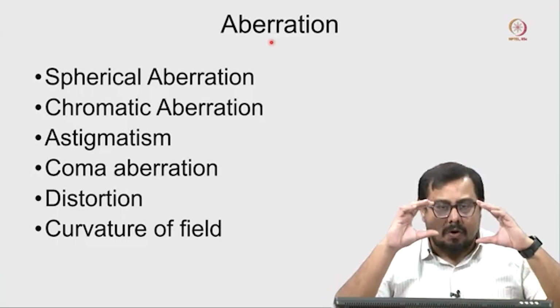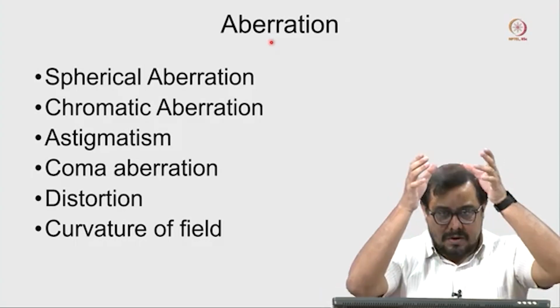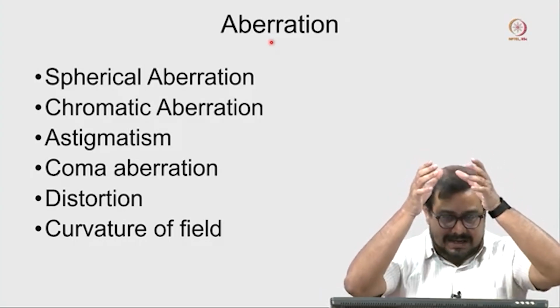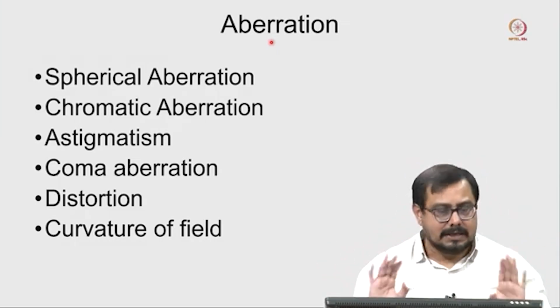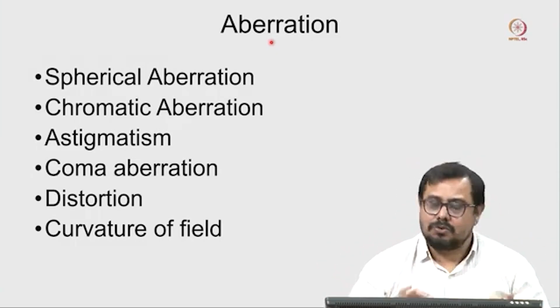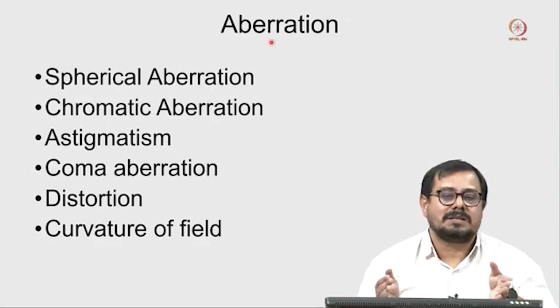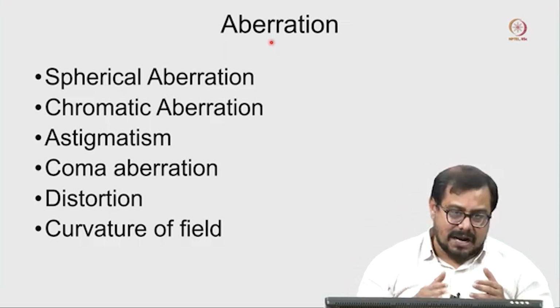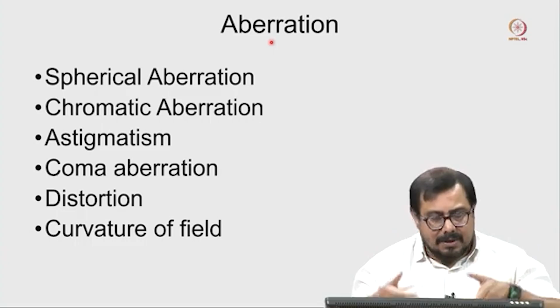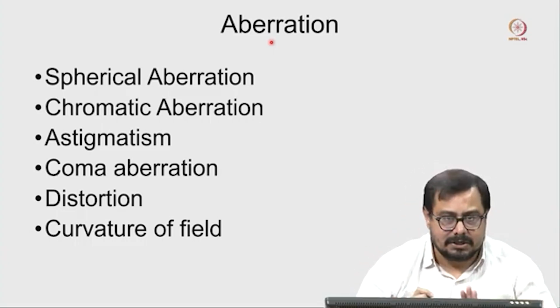We are always considering everything in an ideal situation, where all the beams are parallel. That is how we draw our ray diagrams. So all are parallel. Then there is a deflection, so there is scattering. So unscattered electron beam and scattered electron beam.